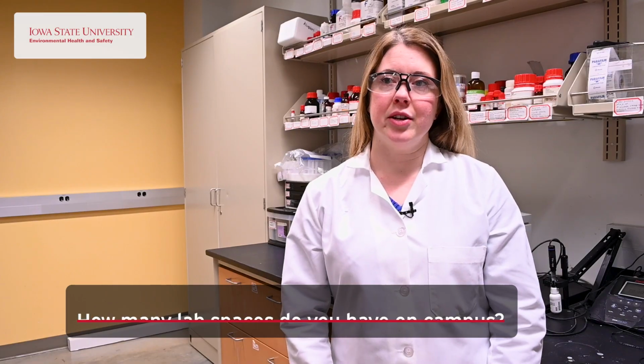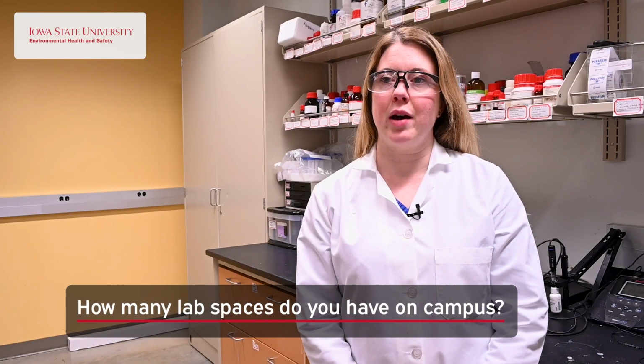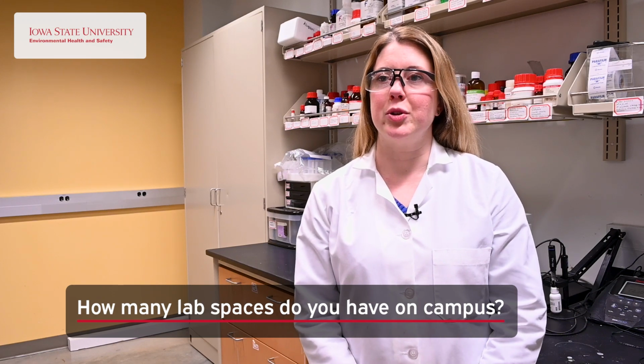Our main lab is here in Hawk Hall, where we have 4 different laboratory rooms, as well as Gilman Hall, in which we have 2 different lab spaces. My lab also works in the Keck microfabrication facility, which is a facility that I oversee.